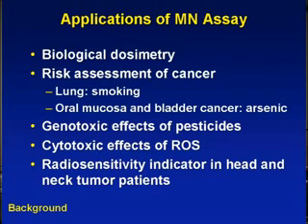We said that this method is becoming more and more popular. This just lists some examples of how micronuclei assays are used for a variety of studies, and most of these are done by the microscopic method. First, most important to this U19 study is biological dosimetry, because it can measure very low dose exposure, especially in the general population without film badges, like most people in this room carry. And this is a great way to estimate the radiation exposure.